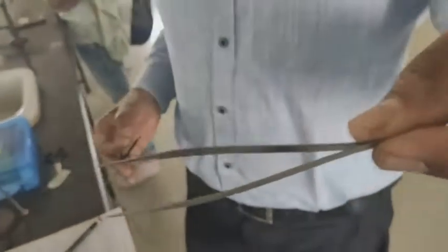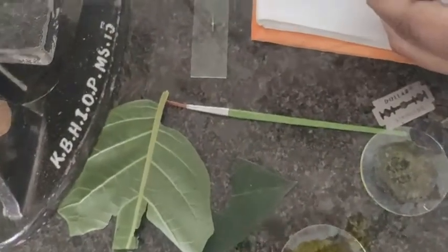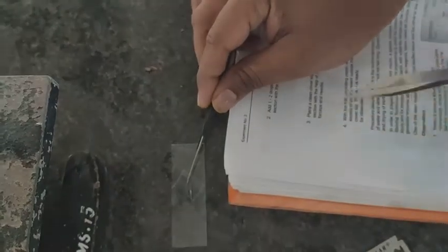The next procedure is with the help of forceps. This is your forceps, and this is your cover slip. With the help of this forceps and this needle you can transfer the cover slip onto this section. All of you can see this is your needle, this is your forceps, this is your cover slip, and in this way you can put it on the section.